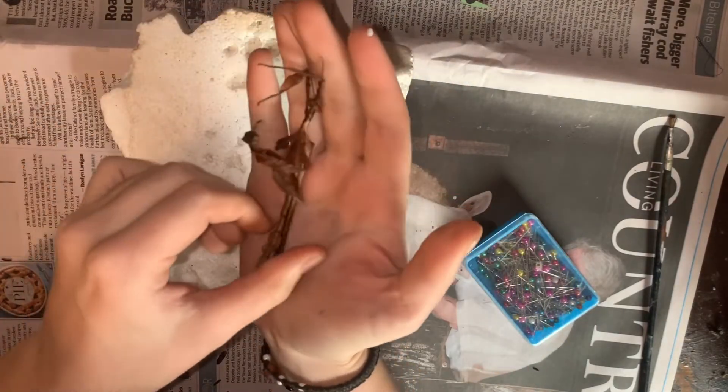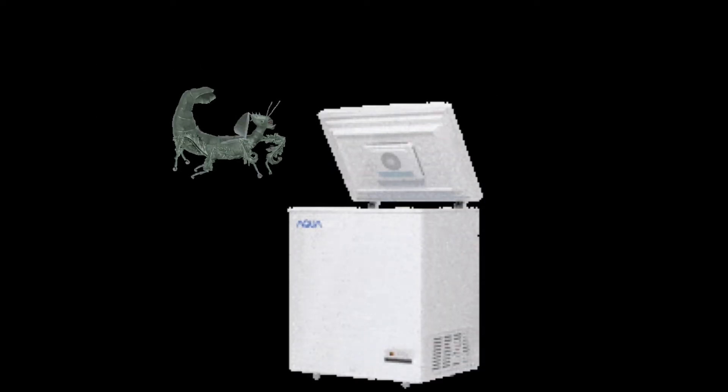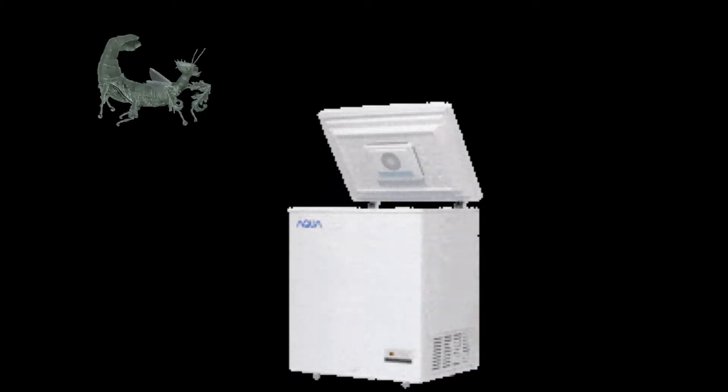Of course, you will also need your deceased male Extatosoma tiaritum. For best results, pin your insects when they are freshly deceased, before the body begins to naturally decay and change color. If you are unable to pin them during the first 24 hours of them perishing, place the stick insect into a plastic bag and then put them into the freezer. This enables the body to remain fresh until you have time to pin and preserve.